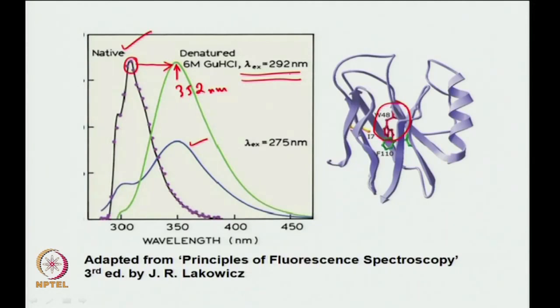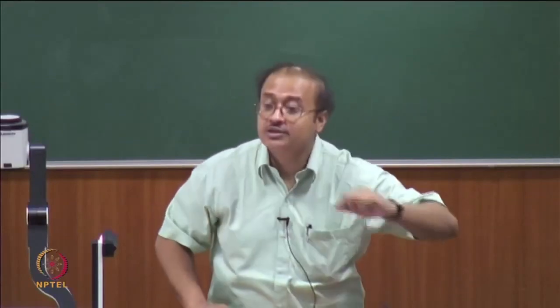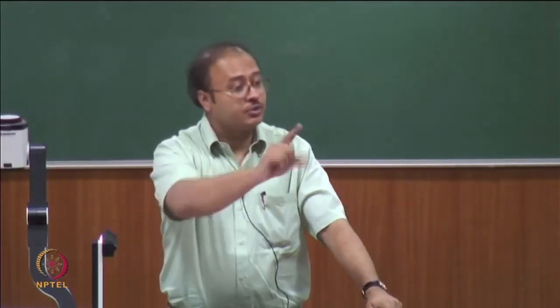We have done this before. To excite only what? Tryptophan, because tyrosine at that place, if you look at the absorption spectrum, is very low intensity. So that means exclusively you would be exciting tryptophan, so whatever emission you monitor is from tryptophan.